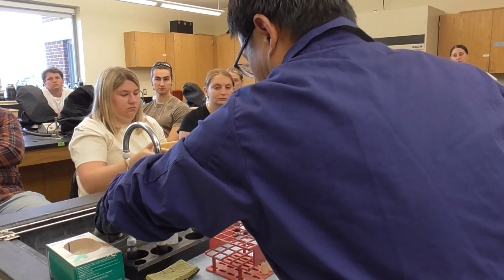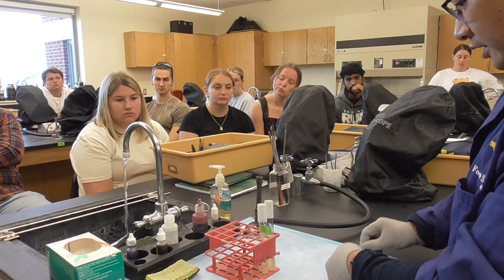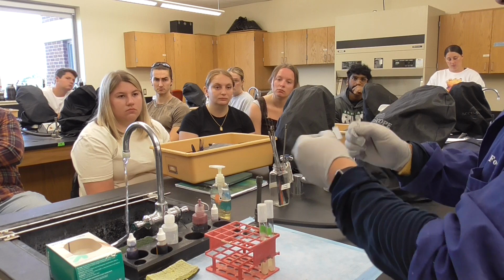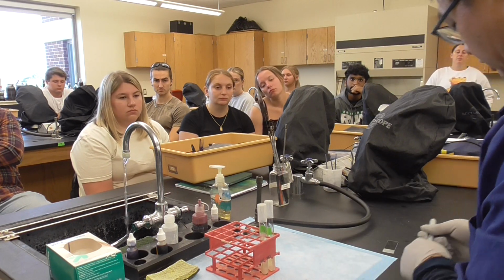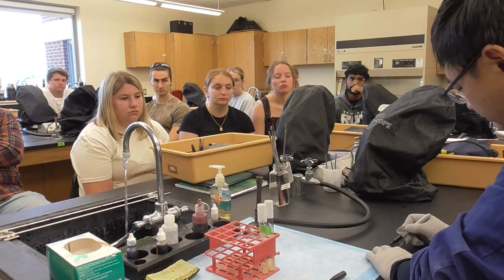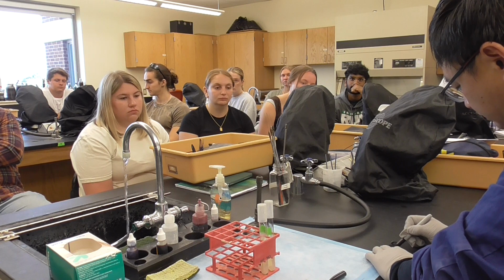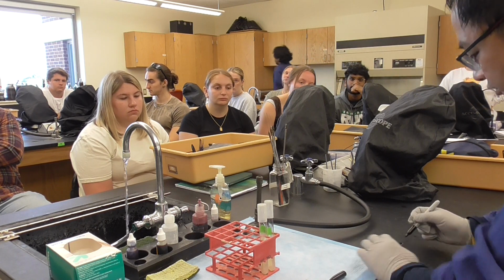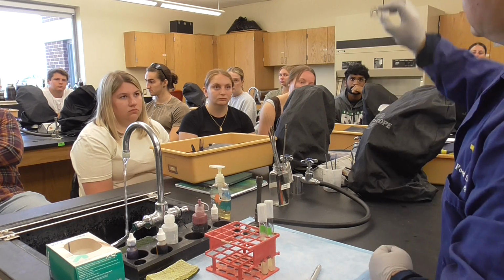Turn on the water slightly, make sure the water is working. Then you have a glass slide like this. Make sure it's clean. Okay, so we're going to draw two big circles right here, and write EC on one side, LF on the other side. So we're going to flip them over.